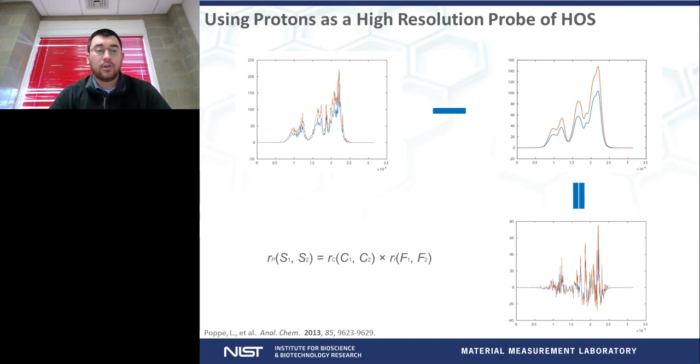The idea is that you utilize proton NMR, which has very high resolution, very high sensitivity, and a very high natural abundance of protons in your sample, and you can get these very detailed spectra. In this case, with this profile experiment, we're collecting a pulse field gradient stimulated echo type of experiment, which is a fancy type of diffusion experiment, which allows us to get rid of any of the excipients and suppress the water signal out, so all we see is the protein.